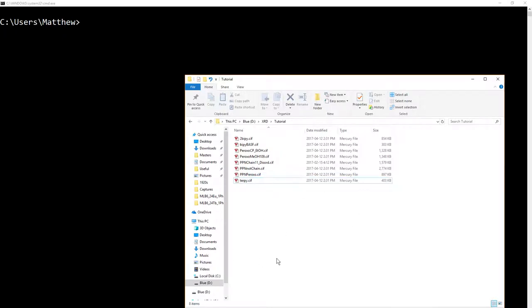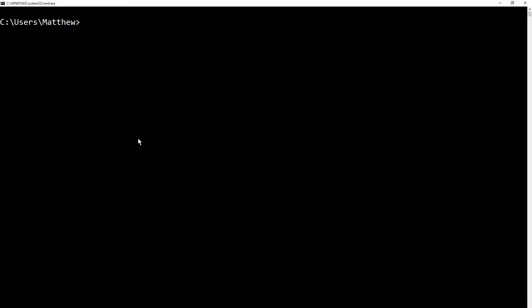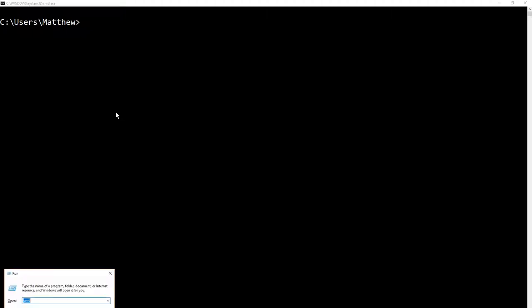That said, let's go over to, we've got our folder of CIFs here. Let's copy that address, dxrd/tutorial. Go over to our old-fashioned DOS command line here. If you don't know how to get to the DOS command line, press Windows key and the R key. This box will pop up. Type in cmd for command.